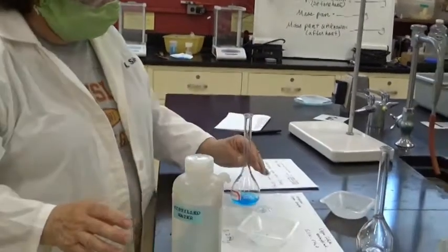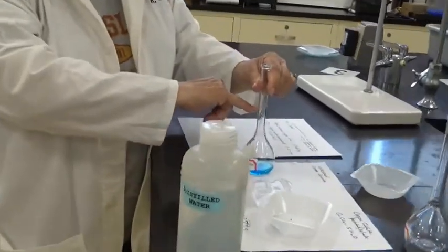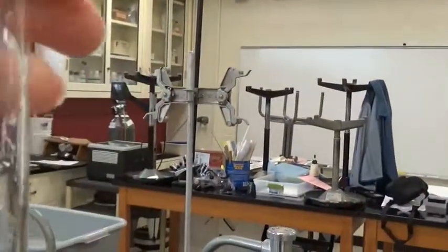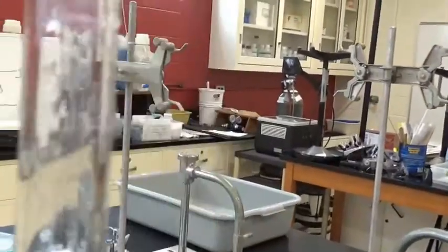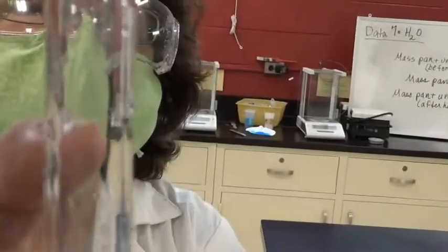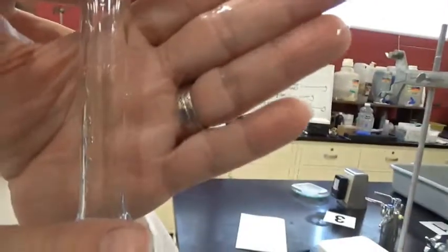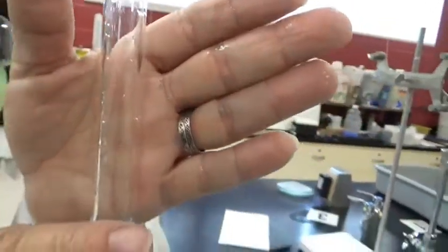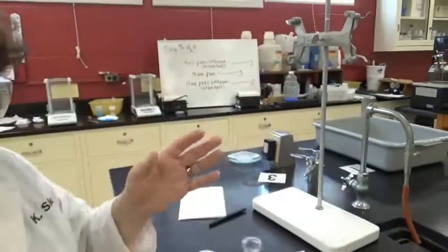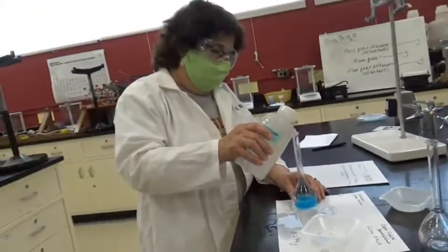And when I make a solution quantitatively like this, you remember that there's a little marker on these volumetric flasks. The volumetric flask is marked to that point. You can barely see it. Where's the mark? It's right here. Okay, that's kind of hard to see. But when I fill this with water up to that mark, and the meniscus rests on that mark, I will have exactly 100 milliliters. I think you probably have seen this. So I'm going to add a bit of water.